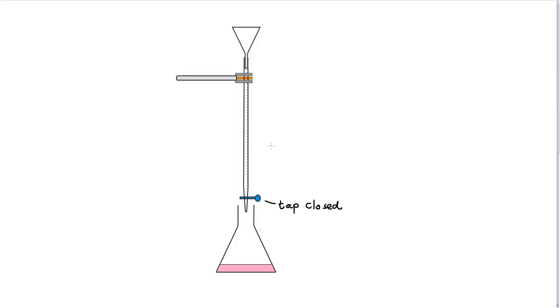Before we start the titration procedure, the first step is to make sure that the tap is closed on the burette. I'm going to put a funnel at the other end and very carefully add the acid to the burette. Once we've done that, we'll take a very careful look at the level of the liquid, taking care to observe the bottom of the meniscus.